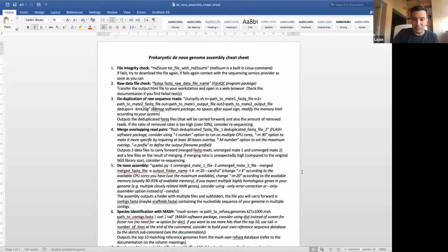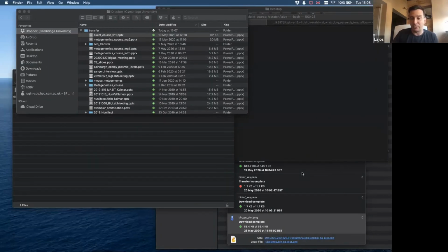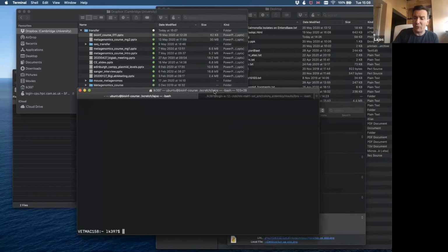As we discussed before, maybe you don't have to do the genome assembly just because it is already done. But as soon as you find something strange in your data, and there will always be something strange, something which seems like an incomplete genome or a contaminated genome, then you can go back to your raw data. I don't know if you send your sequencing to the Sanger, if you have a chance to get the FASTQ files.